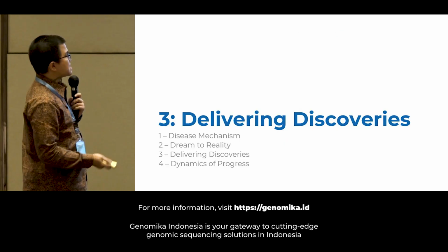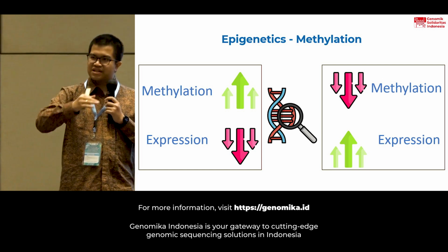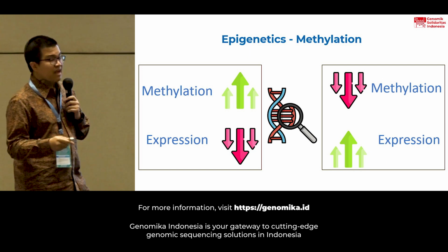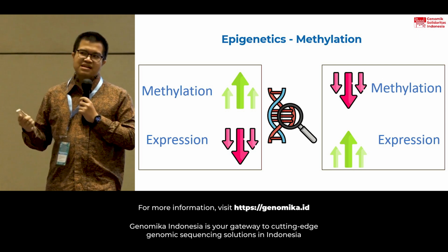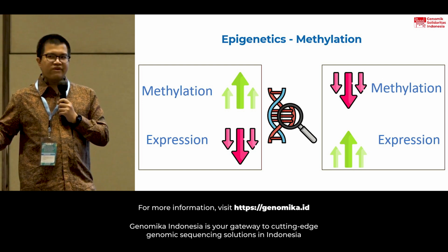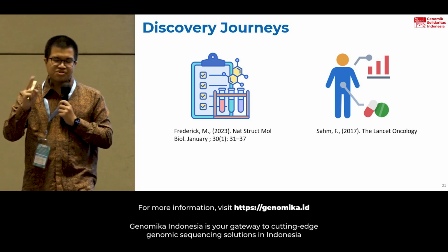Now, delivering these discoveries is a whole different story. To describe this without taking the thunder out of our next wonderful speakers, I will talk about one that relates closely to immunology, which is methylation and epigenetics. Now, a lot of methods have been used to analyze epigenetics and methylation, but one of the most versatile is long-read sequencing because it allows for non-modified analysis. There are two very important journeys that I would like to introduce today.